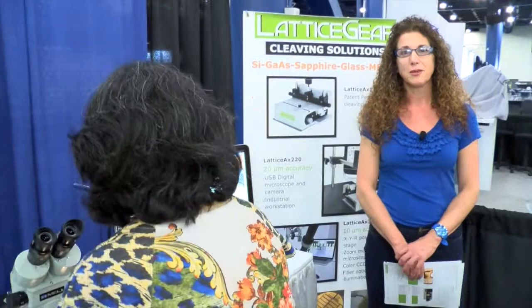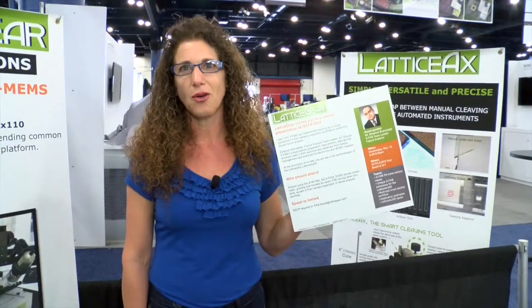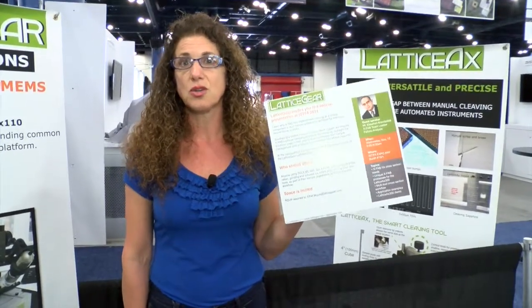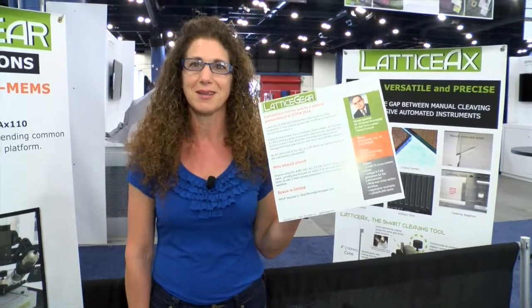We invite you to a demo at our booth number 521. Please join us on Wednesday at nine o'clock for a user discussion on sample preparation that includes also the LatticeX. Thank you.